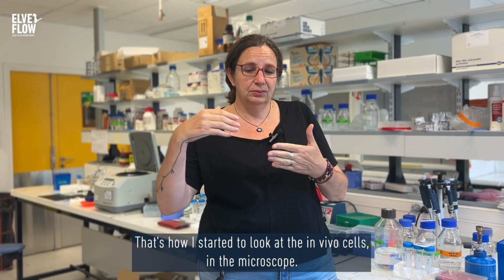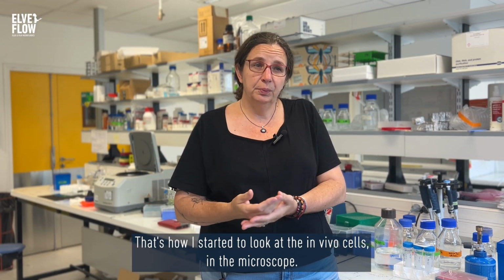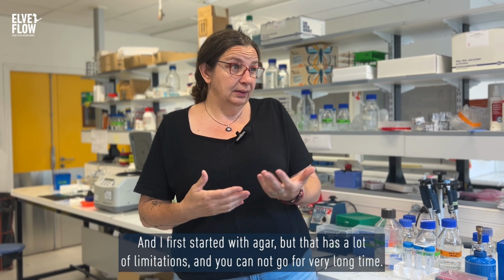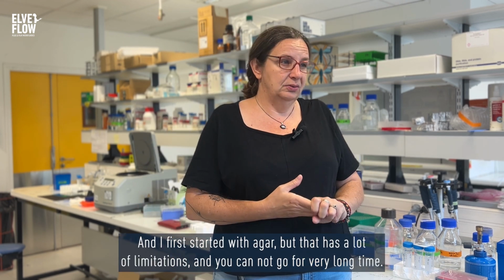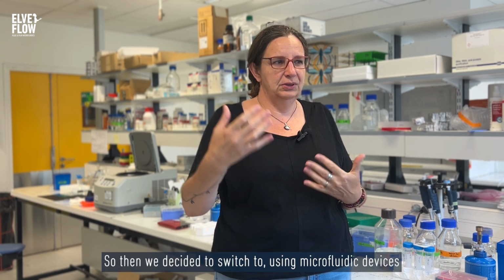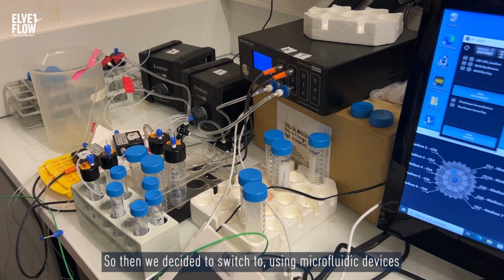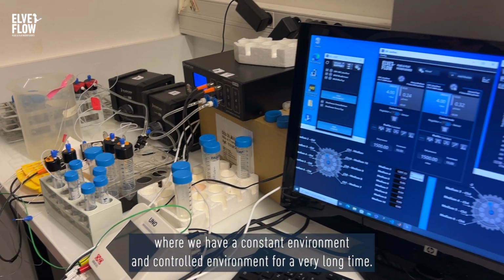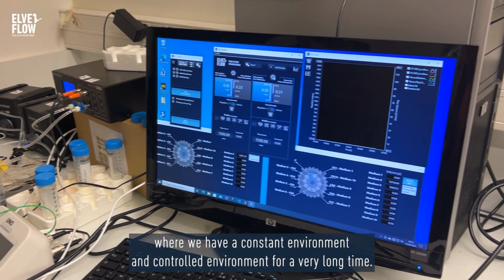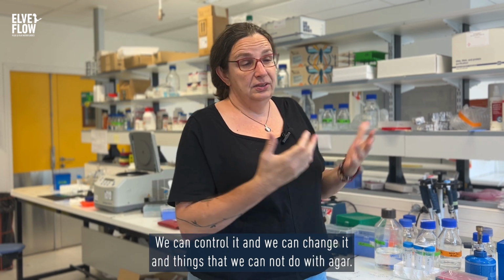That's how I started to look at live cells in the microscope. I first started with agar, but that has a lot of limitations and you cannot go for a very long time. So then we decided to switch to using microfluidic devices, where we have a constant, controlled environment for a very long time. We can control it and we can change it, things that we cannot do with agar.